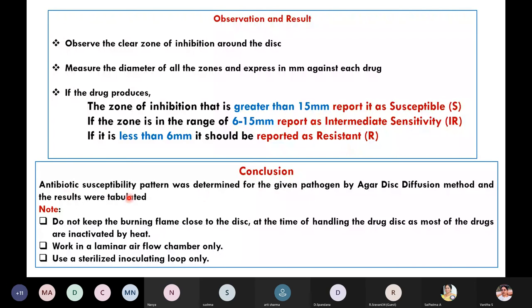The conclusion is that antibiotic susceptibility pattern was determined for the given pathogen, and results can be tabulated as susceptible, intermediate sensitive, or resistant. An important precaution: do not keep the disc very close to the flame, as the antibiotic on the disc can get inactivated by heat. Work only in the laminar airflow chamber and use sterilized inoculating loops.